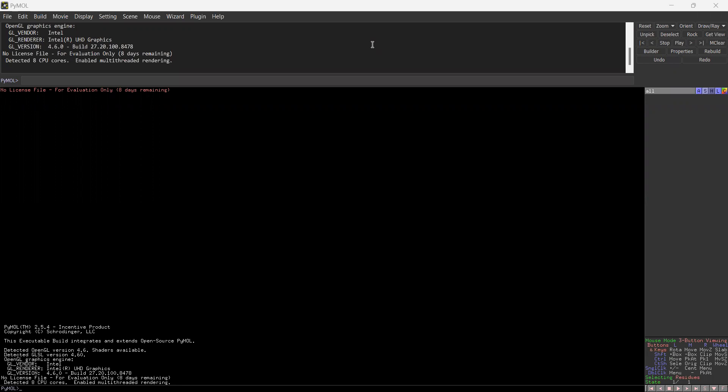Here I'm going to show you how exactly you can load one complex structure. You can get that particular complex structure directly from the PDB database of protein and ligand, or else if you have performed the AutoDock Vina for the same, you can load that in the form of a PDB file. We are going to see how exactly the interactions can be visualized in PyMOL with respect to the representations. So we are going to begin now.